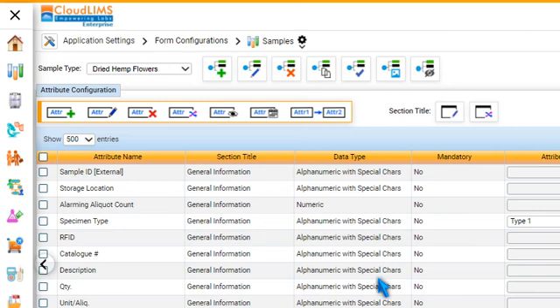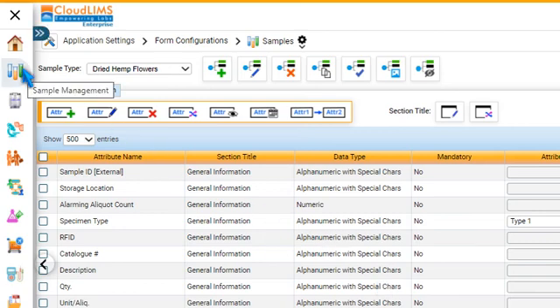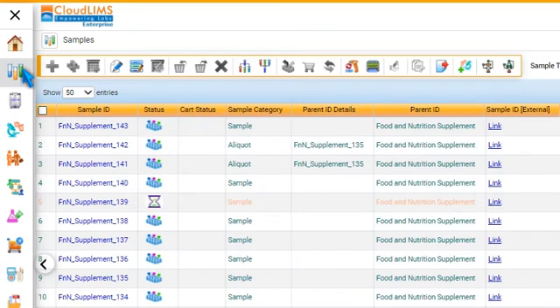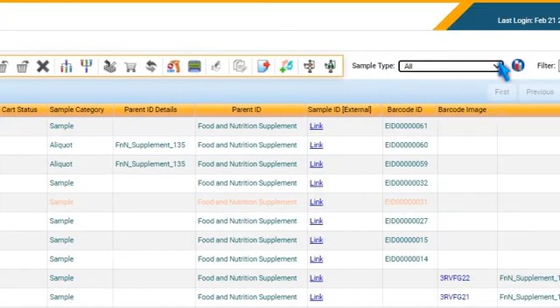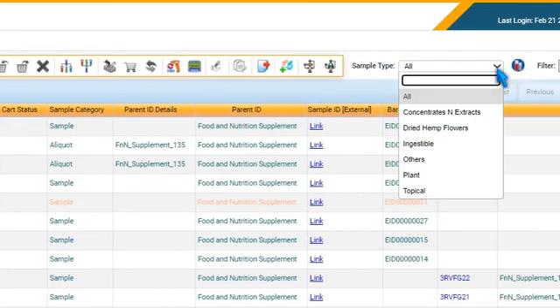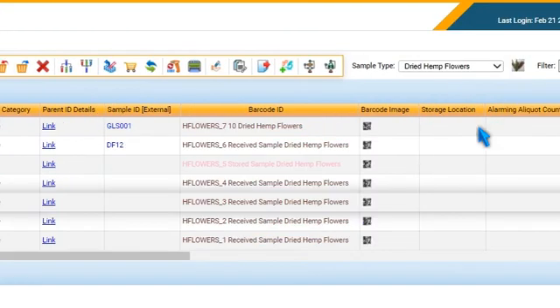Now, switch to the Sample Management module. Select any of the sample types with which you have associated the workflow template.